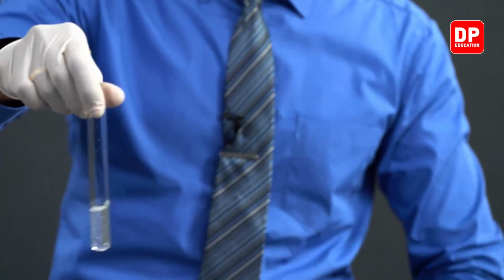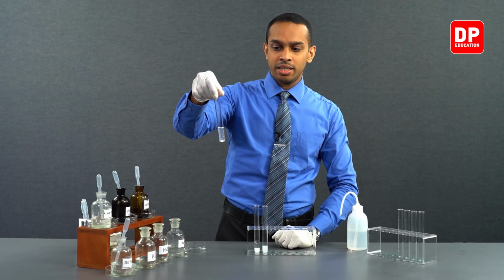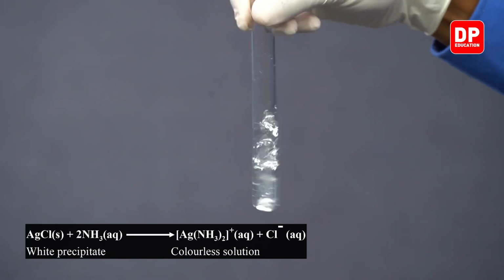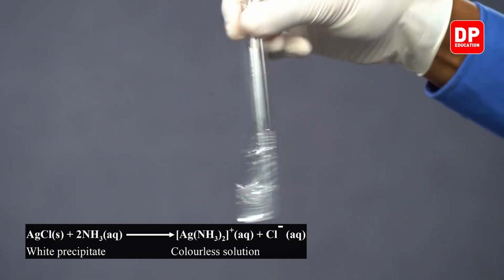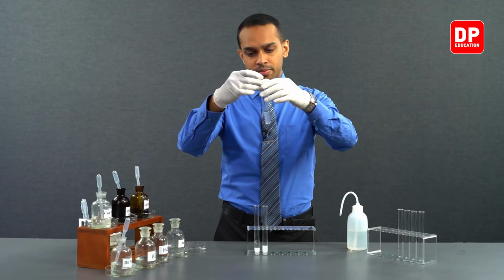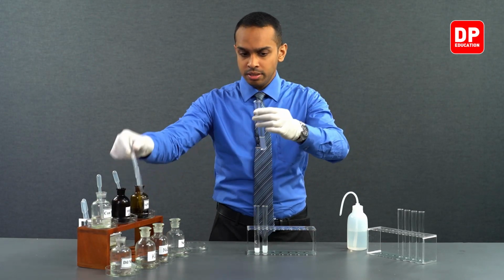Now let me give it a little shake. You can see the precipitate is starting to dissolve. Since we have a lot of precipitate, it takes a lot of dilute ammonia to dissolve it, and it takes a little while. So we'll give it a little while until everything is dissolved. I'll have to add a little bit more dilute ammonia.